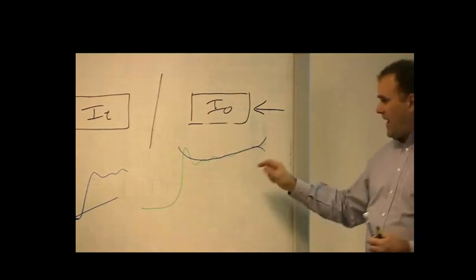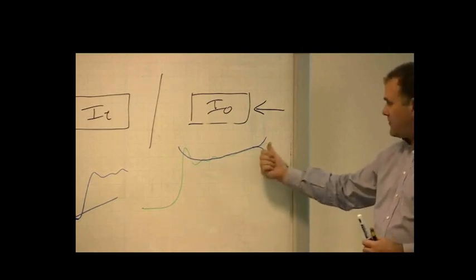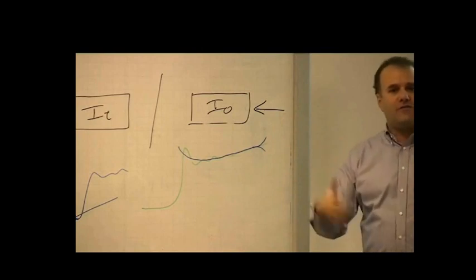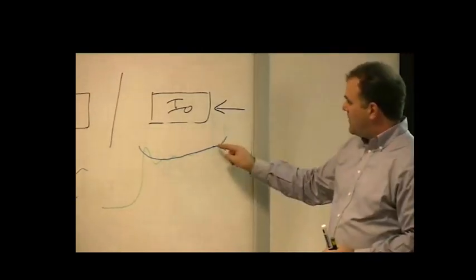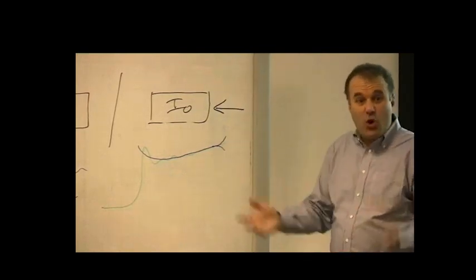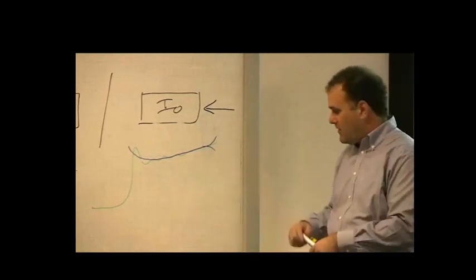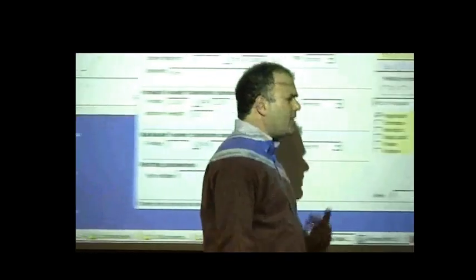In the last few data points, the spline is a bit ill-constrained because there's not more spline on the other side. And you will find in certain situations that without this thing called a spline clamp, this effect will happen in real data. And it's just kind of annoying because you end up losing the last few points of data because the background is done so wrongly. So spline clamps are a way to try and address that problem.